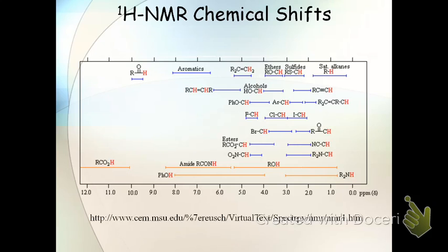So to see an alcohol, for example, at 0.9 is pretty rare. Typically it's up in this range here. So I wish they would fix that, but I may have to just remake the slide myself. Okay, so that's the introduction.